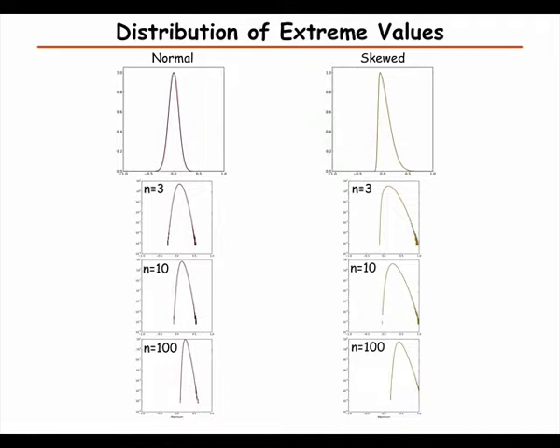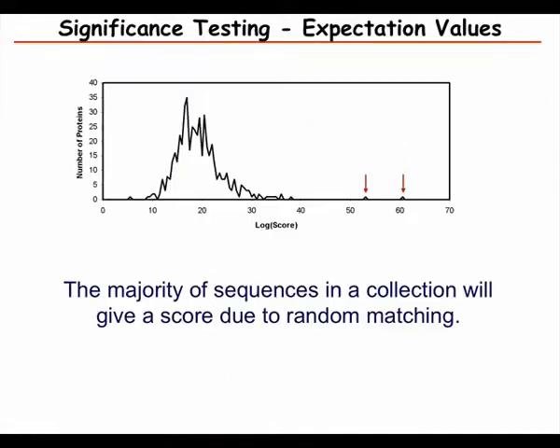So for some scoring algorithms, like for example BLAST, one can actually show in a formal way that we have an extreme value distribution with an exponential tail. Now no one has actually shown it for the mass spectrometry scoring algorithms, but when one looks at the results, it looks very much that in a lot of cases we get an exponential function.